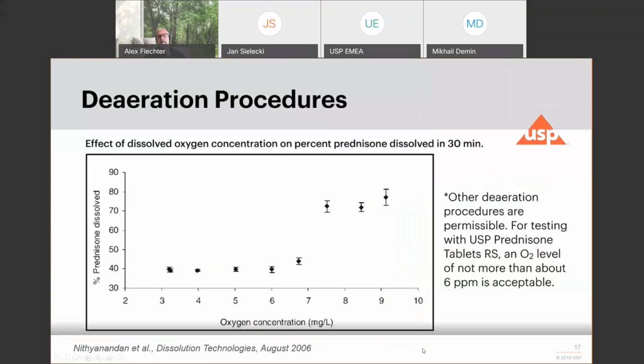There are other deaeration procedures. This one is used for the PVT, and we encourage you to do the same thing, not only because it is very efficient, but it's also very inexpensive and probably can be used anywhere. What you will achieve when you do this test, this medium degassing, is a rest oxygen concentration of about 4.5 ppm. Everything that is below 6 ppm will stay in terms of results.